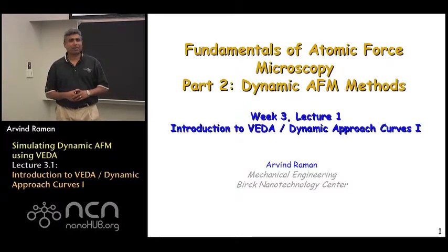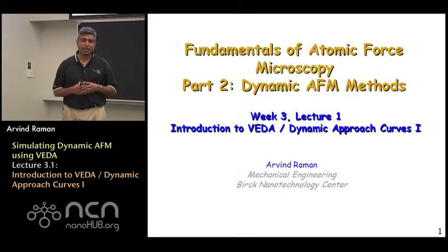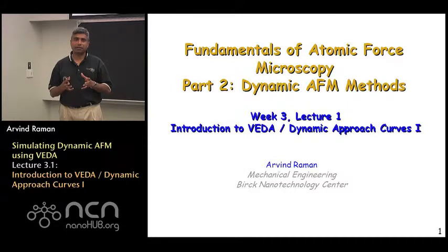We acknowledged that when you try to understand the meaning of images that you get in dynamic AFM, you need to have a model to really understand what's happening at the tip-sample interface, because we observe the tip-sample interaction physics through the effects that it has on the oscillator.